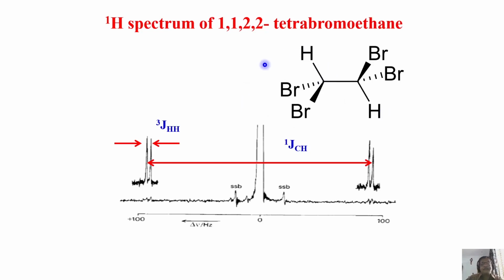And this we analyzed earlier. Now what I do is, forget about this, it is an old-type experiment. They were spinning the sample and used to get some artifacts because of inhomogeneity of the magnetic field. We will worry about it later. I'll discuss when I come to practical applications. So now these are the satellites, plotted with enhanced vertical intensity. What does this separation give you?